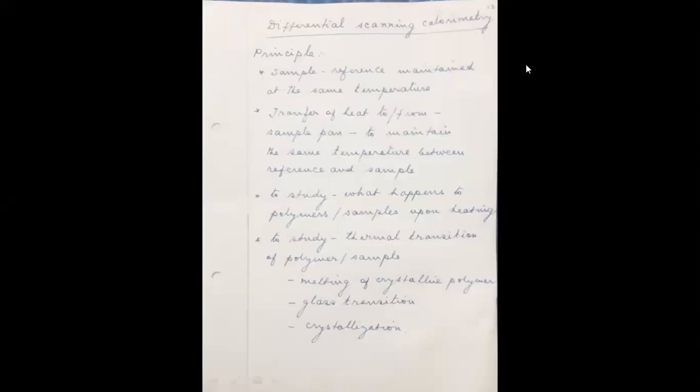So, differential scanning calorimetry. Watch closely. This thing is a little bit difficult to understand because we are not familiar with differential scanning calorimetry. Here we are having two substances. One is the test sample, and the other one is a reference substance.